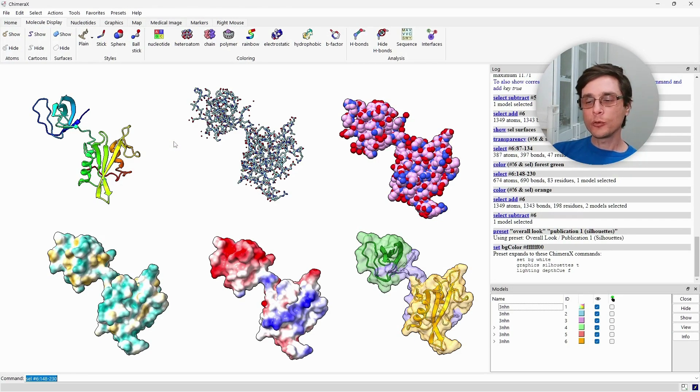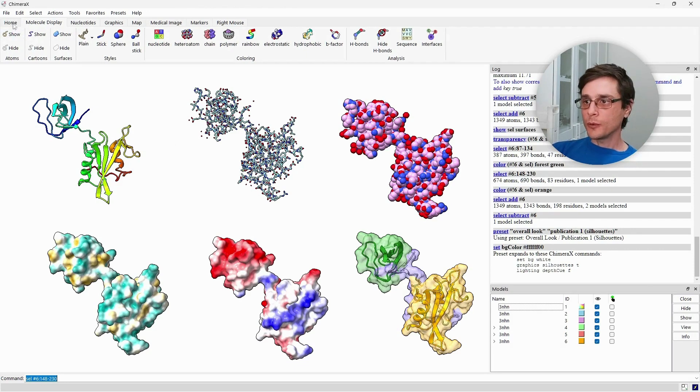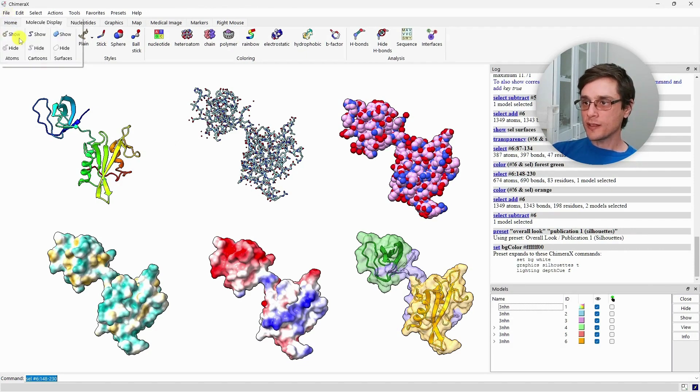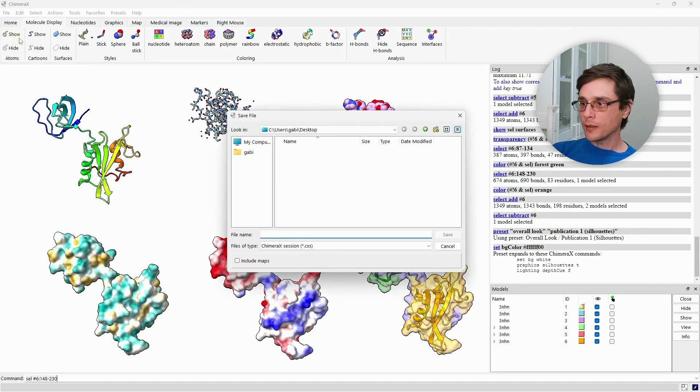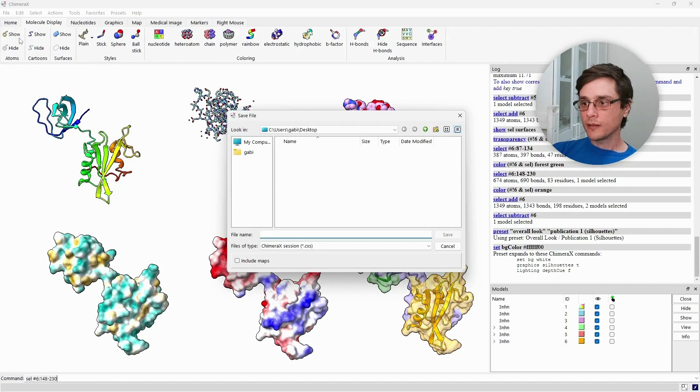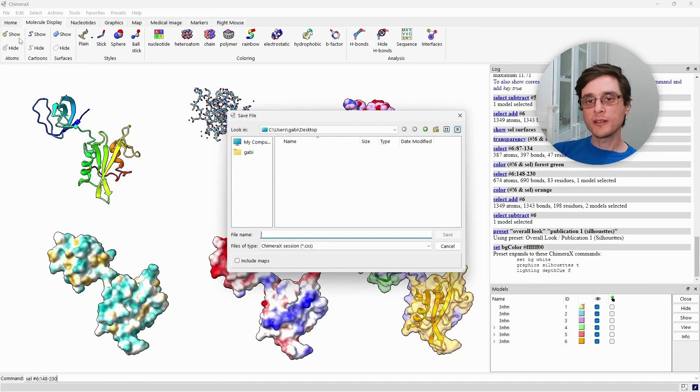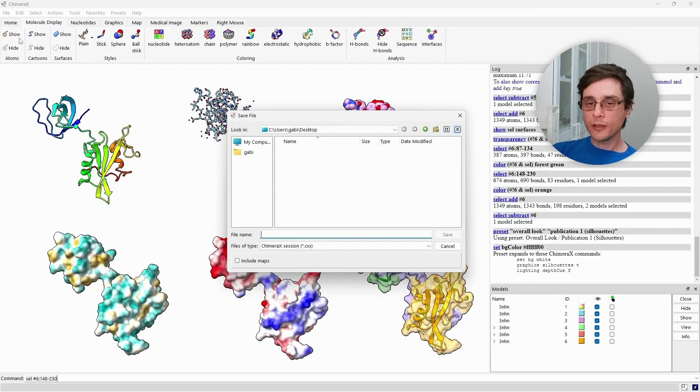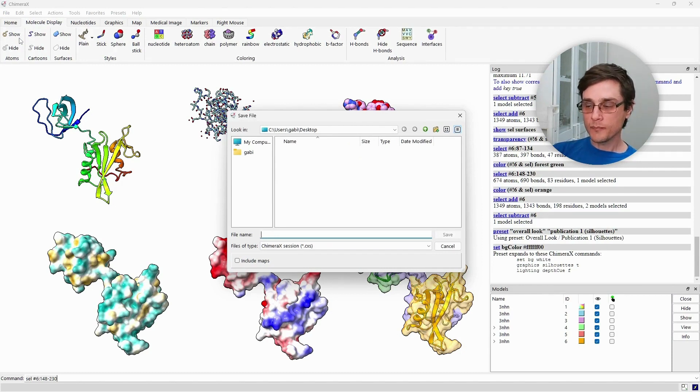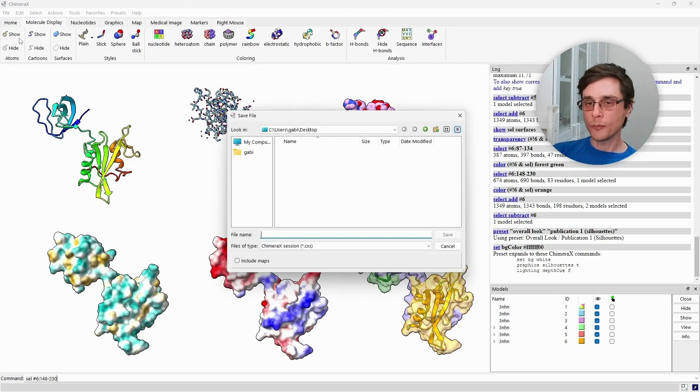When you finish your work, you would probably want to save it. You can either save it as a ChimeraX session. This way, all your styling and anything you did is saved as part of the session. You can then reload it and continue your work as it is with the same structures as you see now.